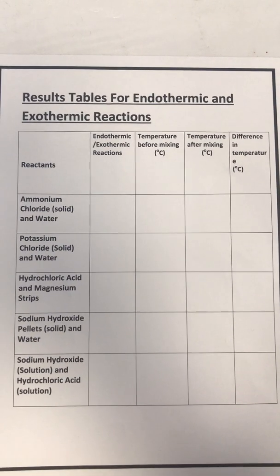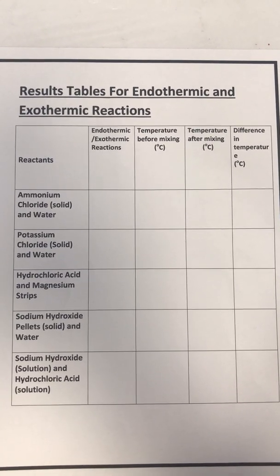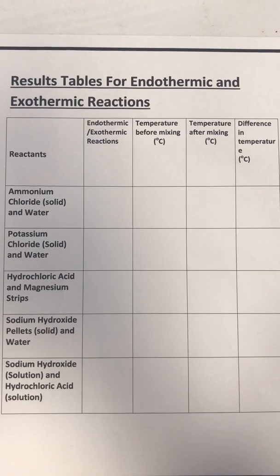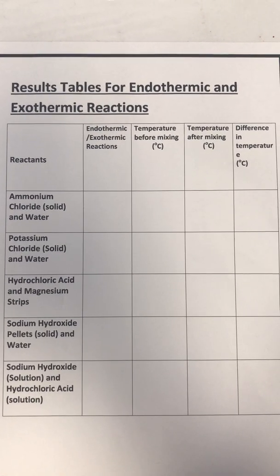We have this table to record the results we will obtain in this experiment. Your teacher may pause this video now so you can copy the table and record the results as we go along the experiments.